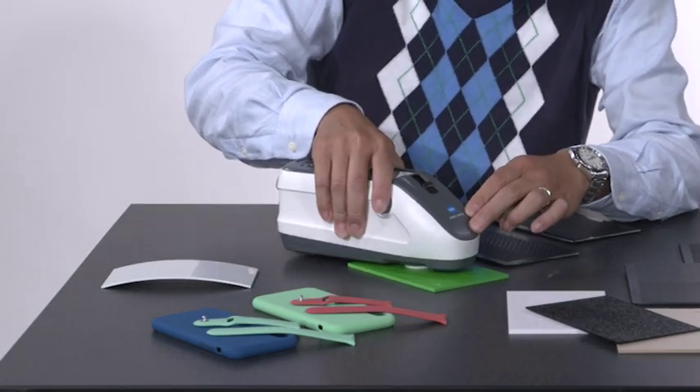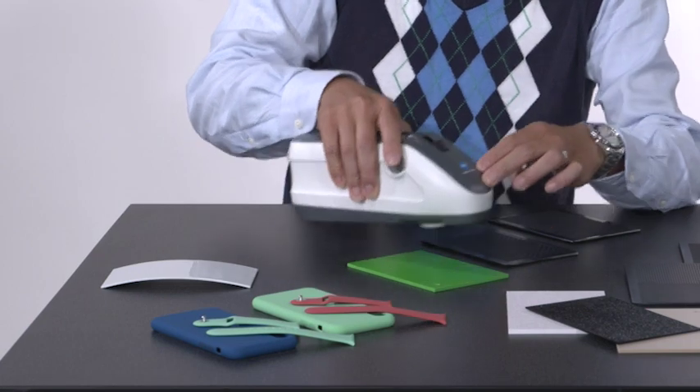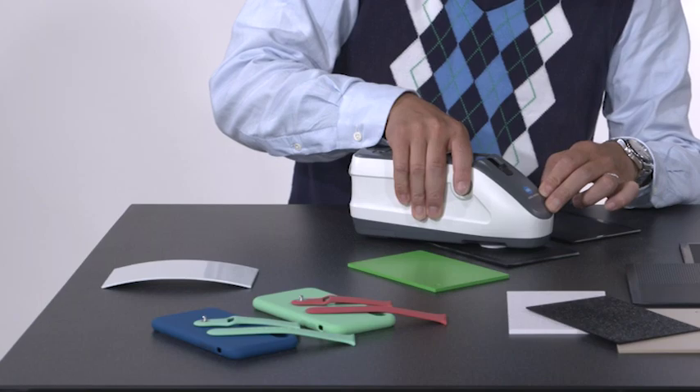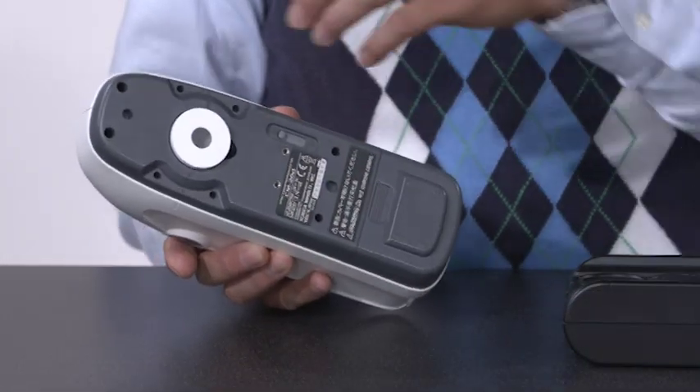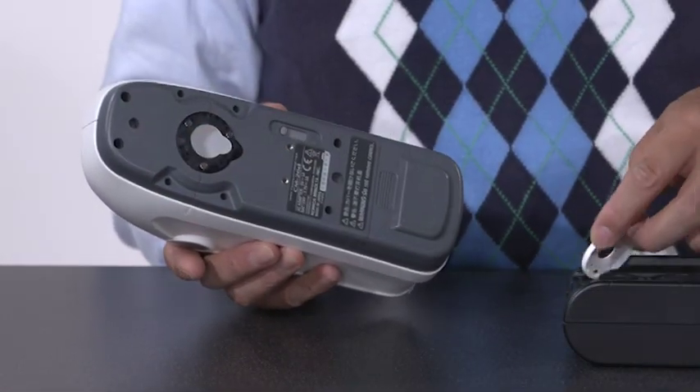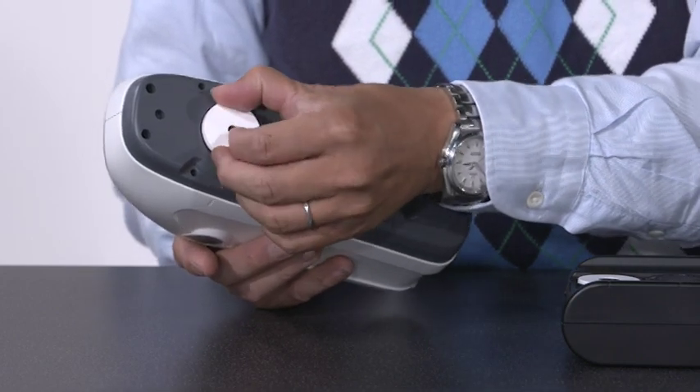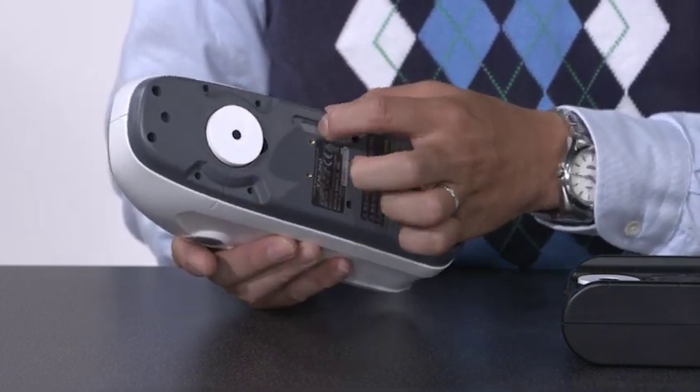The CM26D is the instrument of choice when measuring textured, curved, matte, or glossy surfaces that are light to dark in color, and can switch between 8 millimeter and 3 millimeter measurement areas. Simultaneous specular included and excluded measurements are performed to ensure consistent color and appearance.